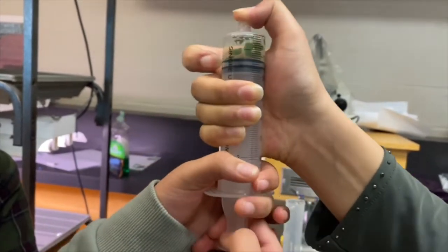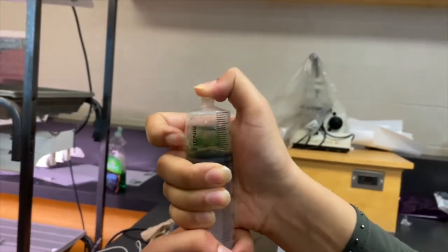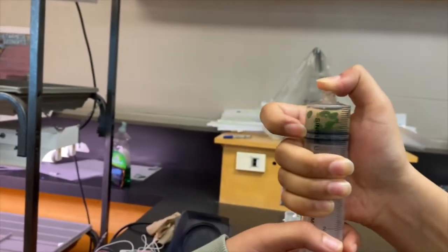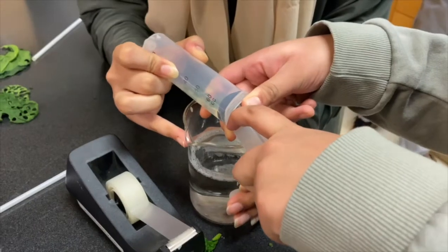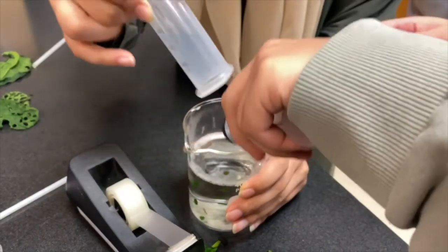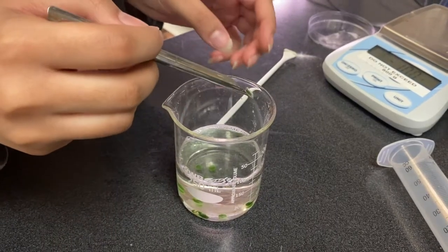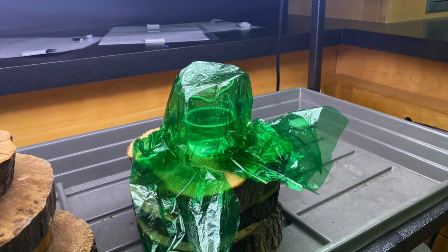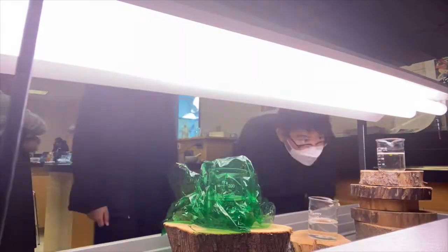Hold the plunger like this for a few seconds before releasing it and letting it snap back. This causes some leaves to sink. Repeat step 11 several times until no discs are floating in the solution. When all the leaves have settled, remove the plunger and pour the discs and bicarbonate solution into the beaker. If any leaves float, remove them from the beaker. Repeat this 3 times separately and make sure there is the same amount of leaves in every beaker.